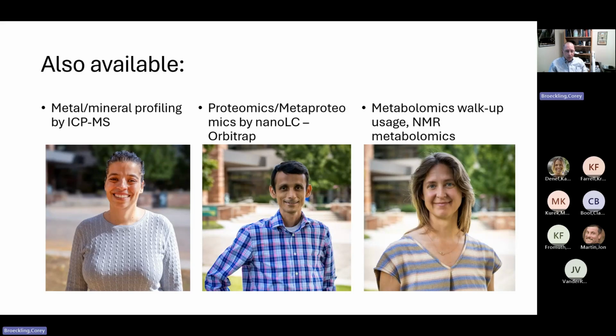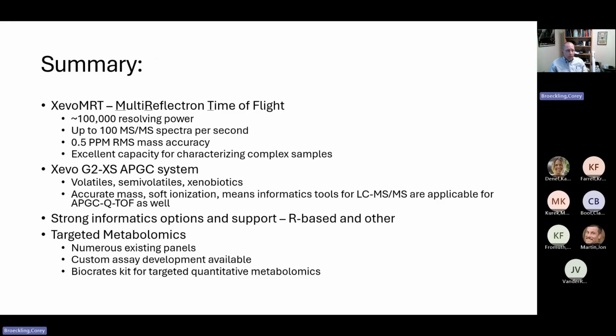And I wanted to also mention Claudia Boot, who runs many of our walk-up instruments for metabolomics, GC and LC systems, with Paul as well in the ARC-MMA area. And I also wanted to mention that Claudia has done a little bit of work developing methods for NMR-based metabolomics as well.